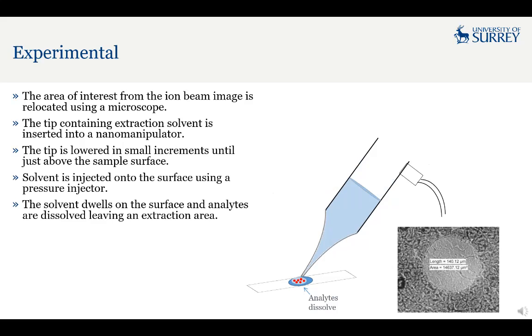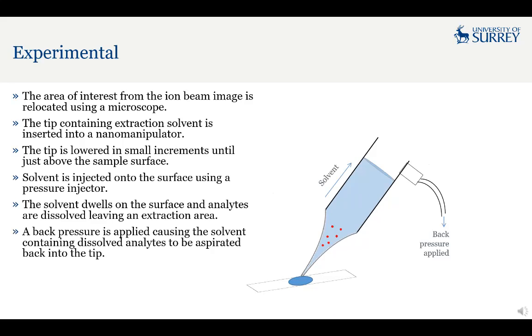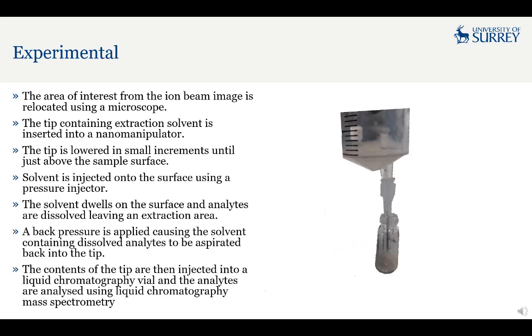the microscope software. A back pressure is applied, causing the solvent containing dissolved analytes to be aspirated back into the capillary tip. The contents of the tip are then injected into a liquid chromatography vial, and the analytes are analysed using liquid chromatography mass spectrometry.